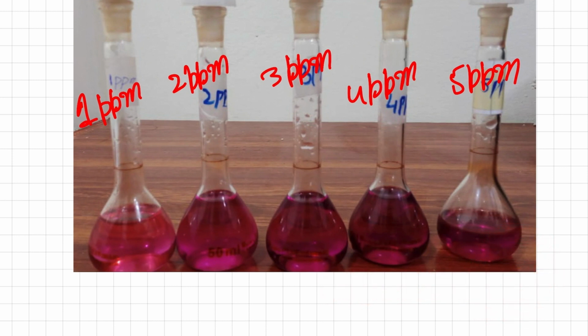So in this way, by adopting the standard dilution method, you can analyze a solution that is even higher than the highest standard that you have used in order to prepare the calibration curve.